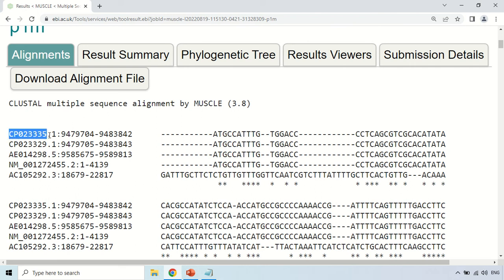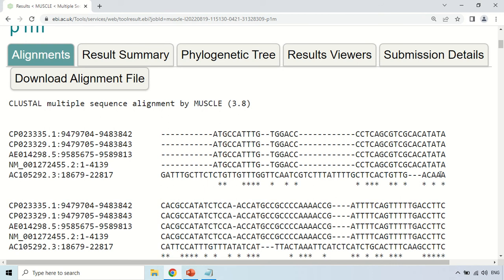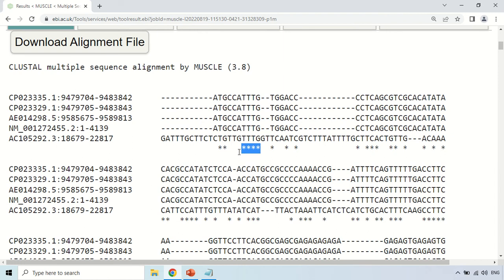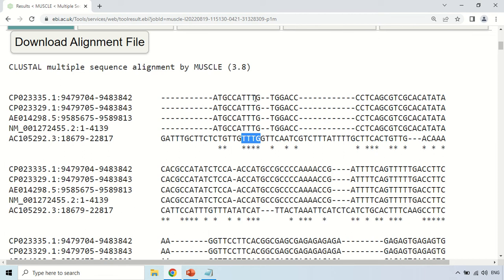This is the accession number of sequence 1, the accession number of the second sequence, and so on — this is information about the sequences. This is the multiple sequence alignment result. Here, these stars represent conserved sequences — where the star is present, it means the same nucleotide base is present in all five sequences. For example, here you can notice a T that is present in all five sequences, so it is a conserved region. Similarly, in this case, four stars — you can clearly see the triple T and G, which is a conserved region present in all five sequences. So star regions are conserved regions.